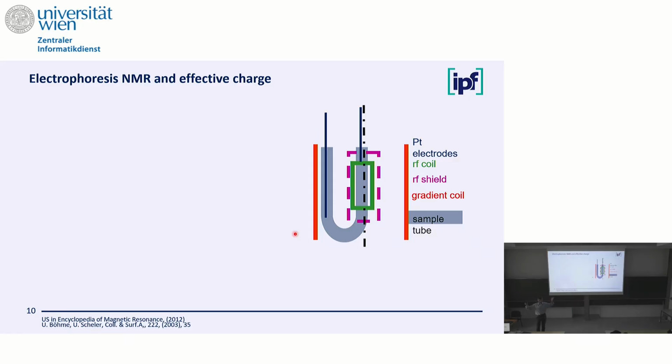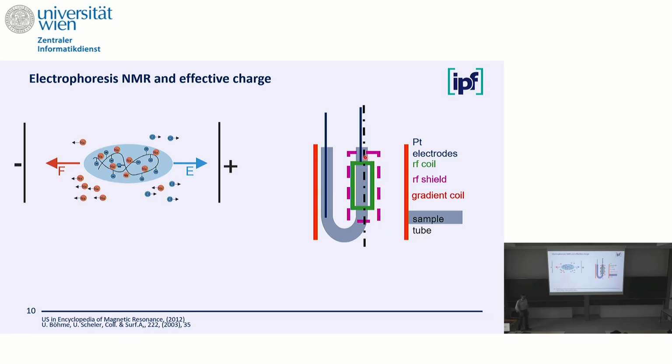We have gas bubbles that come out, and with this design, the gas bubbles come out either on this wing of the U or above the sensitive volume. And therefore, in the green radio frequency coil, I can measure the displacement, the velocity and also the direction. That's important for what I'm trying to do.